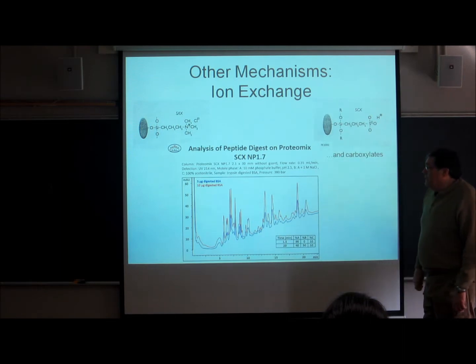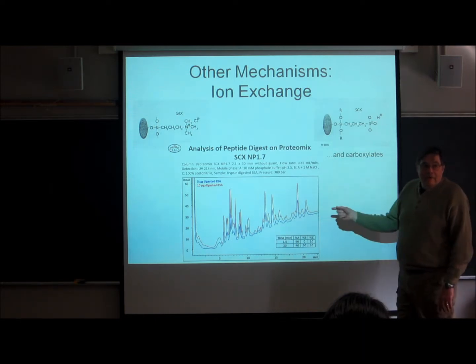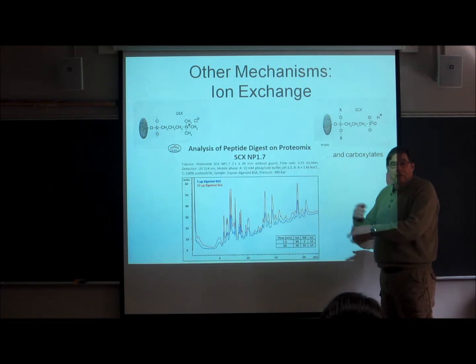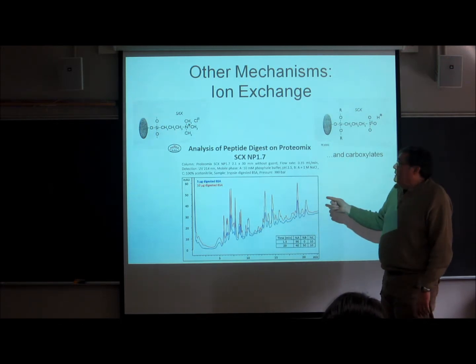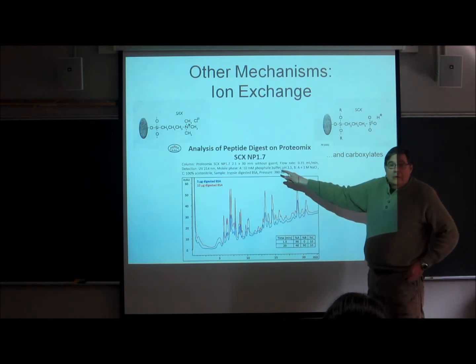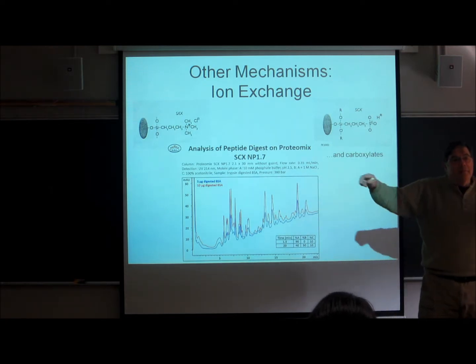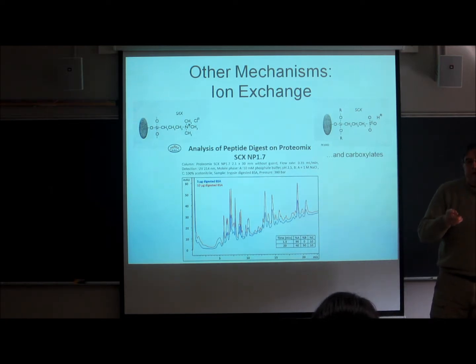Here's a picture I pulled out. A tryptic digest of bovine serum albumin, BSA, which is kind of a tour de force material for doing peptide investigations, meaning that if you want to show off the instrument, you can do this. Anybody know what trypsin does? It digests BSA. Along the chain of the peptide, it looks for lysines and arginines, and it will hydrolyze those points.